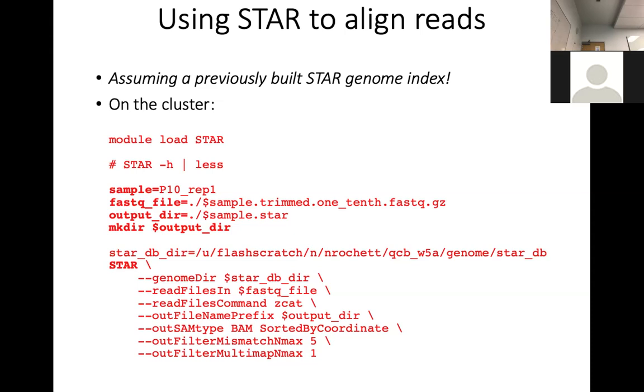Yeah, just copy this one file. So this is just working on one FASTQ file. So you may want to copy this file to your own scratch folder, or you can just work on the one that's in mine.